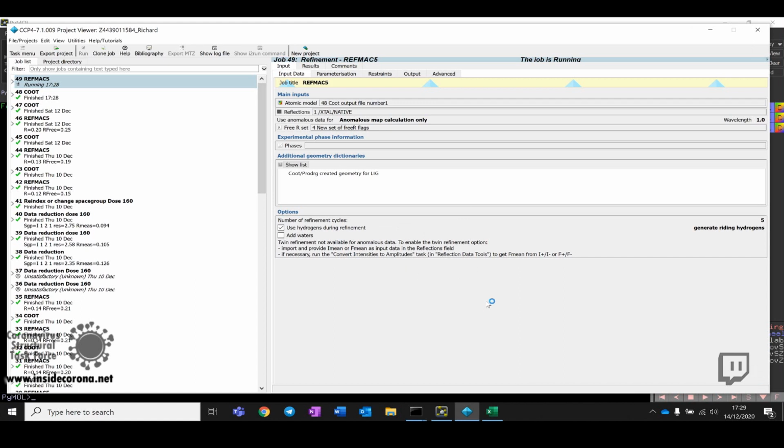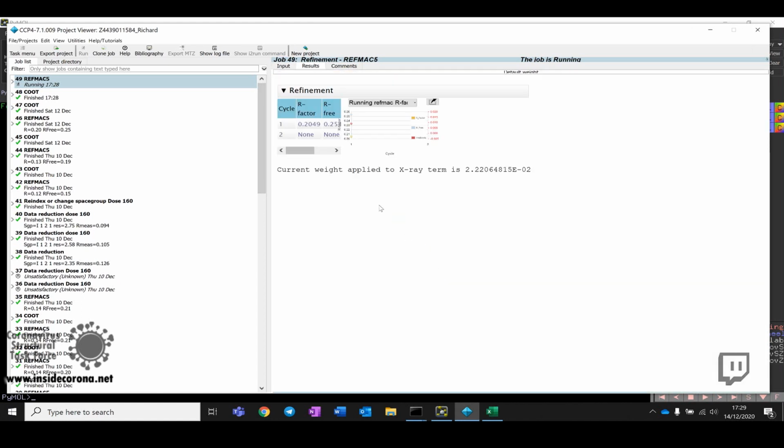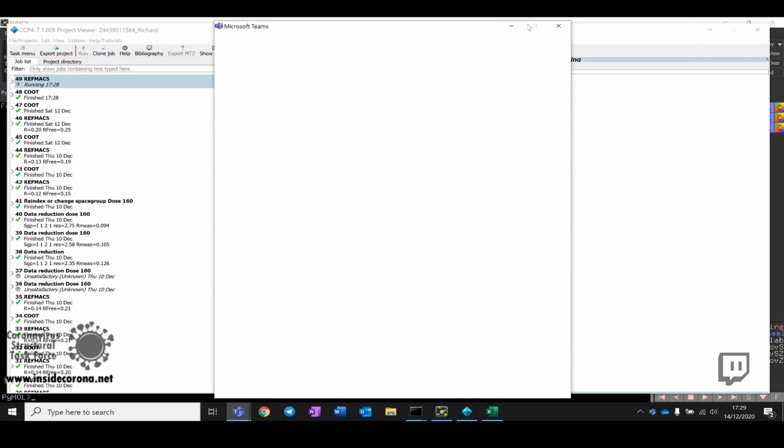Okay, we're back, and refmac is currently running. So what refmac is doing right here, go away Teams.